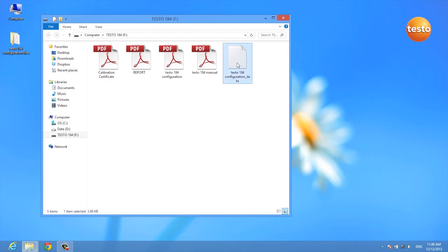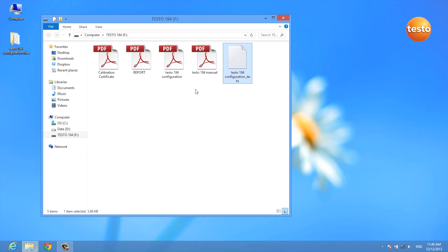As you can see, the XML file was created and your data logger is already configured.